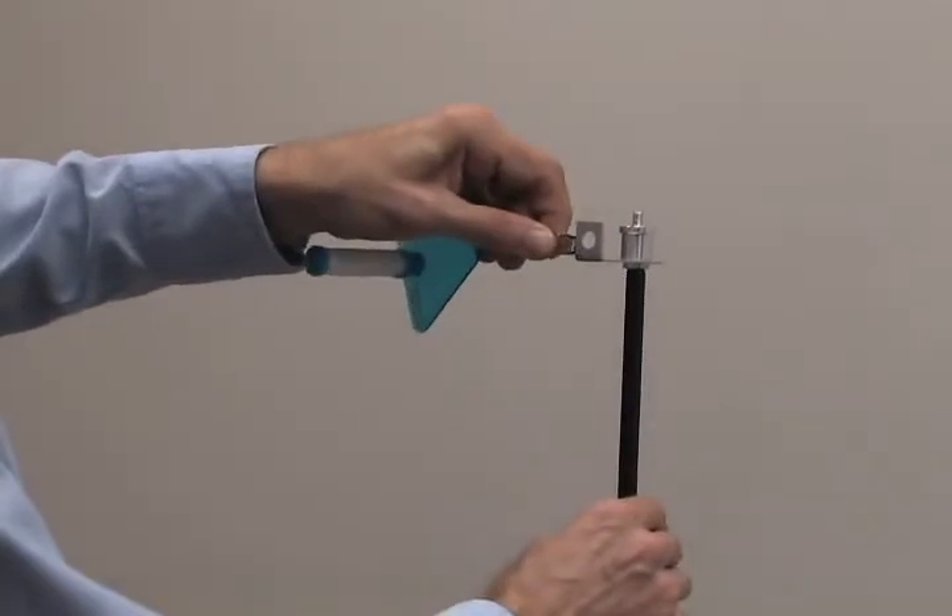Step 3. Place the assembled device on a worker in the breathing zone or area location to be monitored.